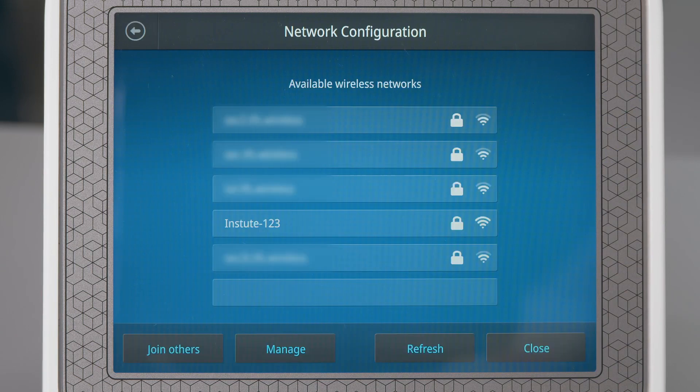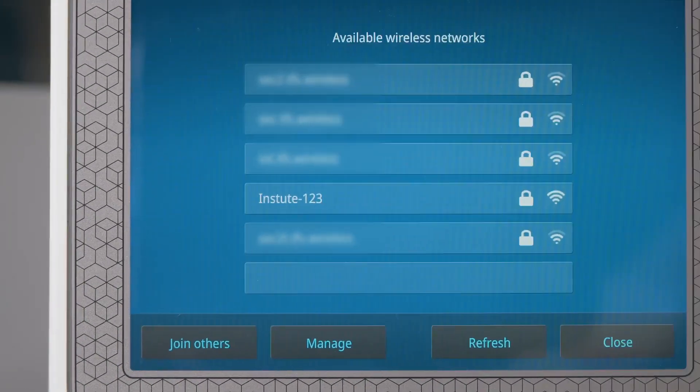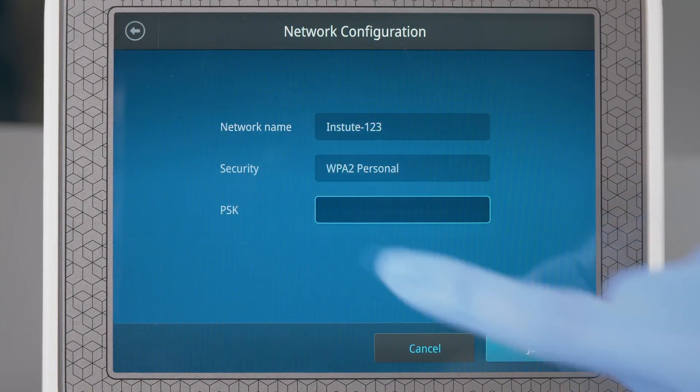a list of the available networks is displayed. Select the network name of your choice or select Join Others. Select the preferred wireless network from the list.